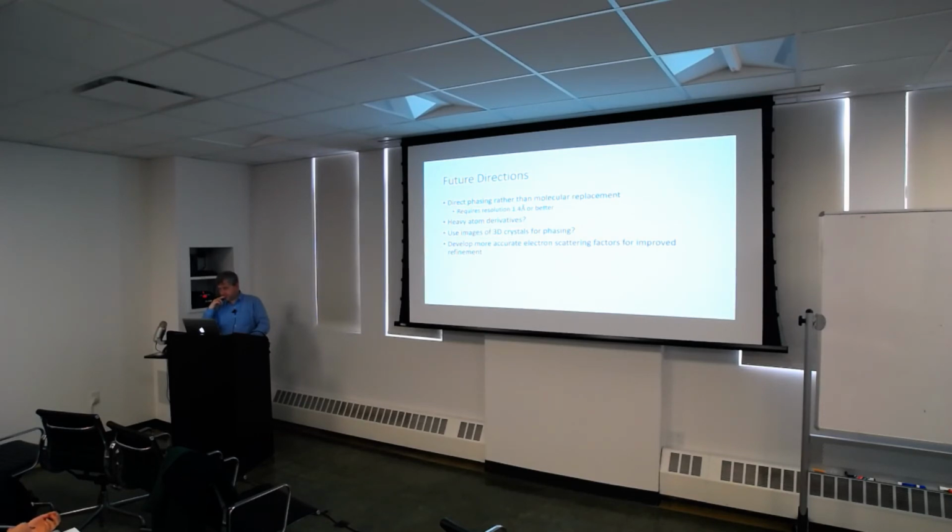So maybe? I think it's something to work on. But not yet. No, they haven't done it yet, to my knowledge, that they published. We need to figure out if electrons can scatter and break Friedel symmetry for other reasons than thickness. So you're thinking they can break because you have different planes of Ewald sphere curvature. Yes, so they have a different plane of imaging, so they break because of that.